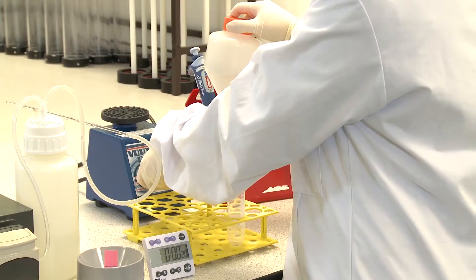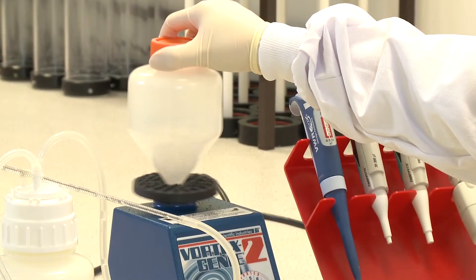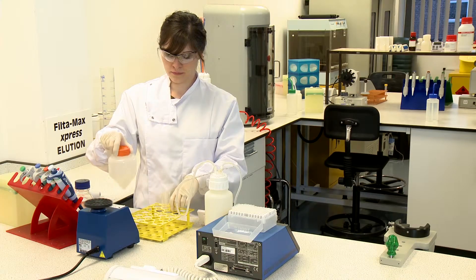Next, vortex the sample at full speed for 20 seconds to disperse the pellet, extending the vortexing time if needed. Swirl and pour it into a 50 milliliter tube.